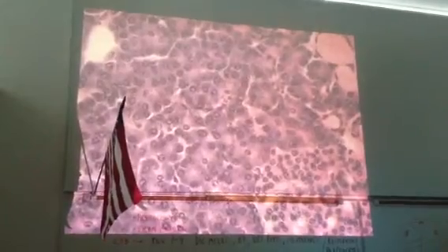Microbes, the islet of Langerhans that we looked at. As you look at this, notice they're all dark around the outside and light towards the center. The nucleus stains, because the dye that's used here is called hematoxylin and eosin. Eosin gives the pink color to the stained section, and the hematoxylin gives the dark color.